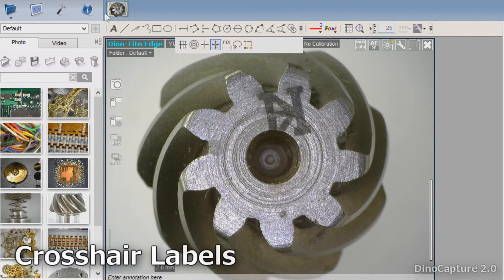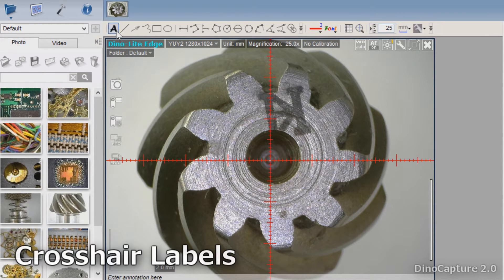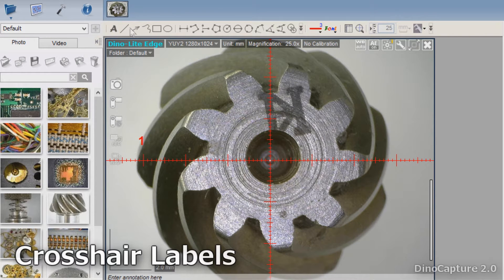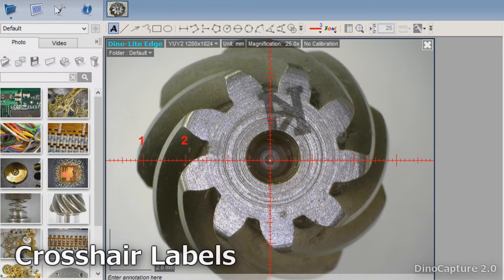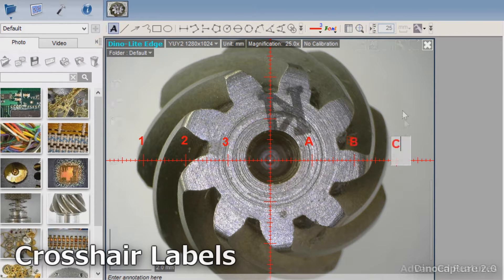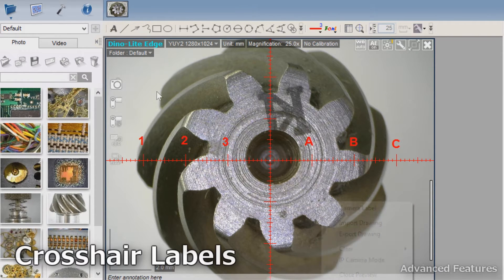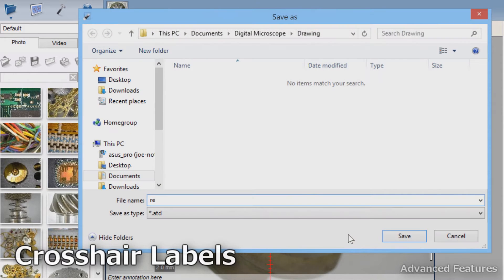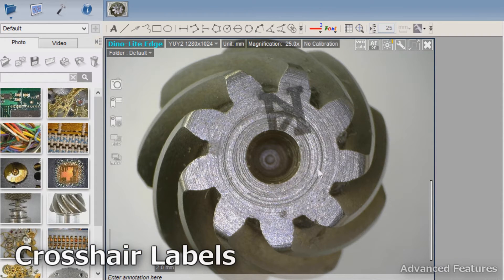You can easily add a crosshair to any live image by clicking on the crosshair tool. Simply add text manually using the text tool to help label the desired increments. You can then right click and select Export Drawing to save the crosshair and labels to be imported and reused later.